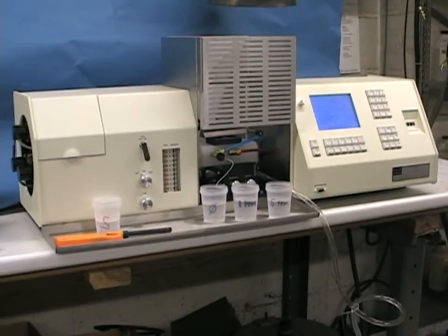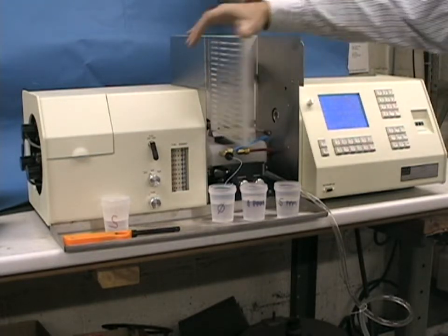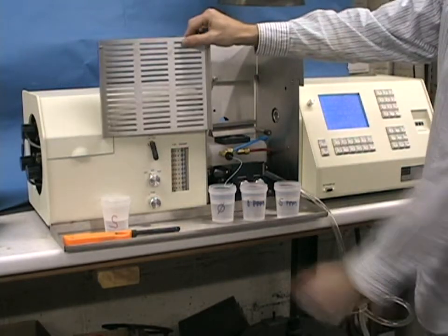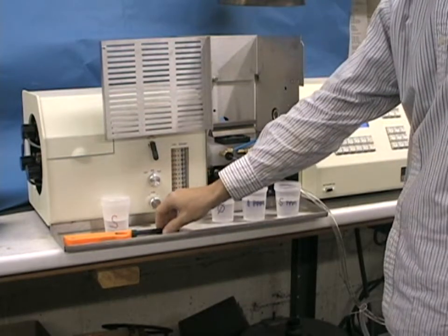The Buck 210AA incorporates a high impact bead nebulizer, which allows virtually any solution of high dissolved solids or organic matrices to be aspirated and analyzed accurately. To begin setting up the AA for the analysis, turn on your air supply, which could be from an air compressor supplied by Buck Scientific, or a high pressure cylinder.